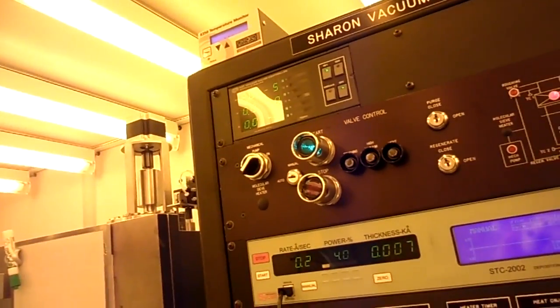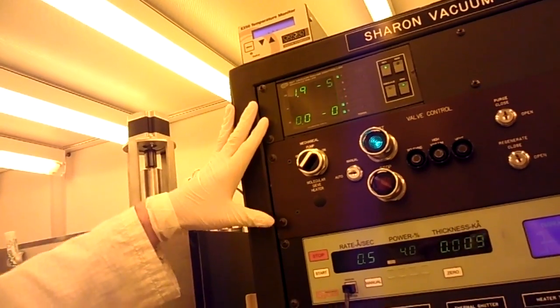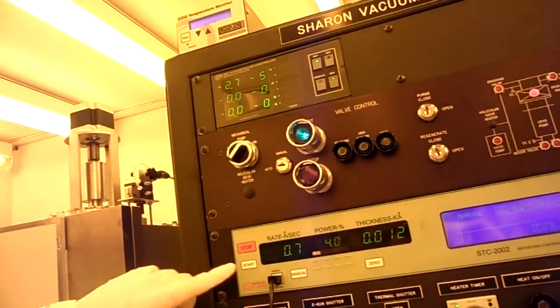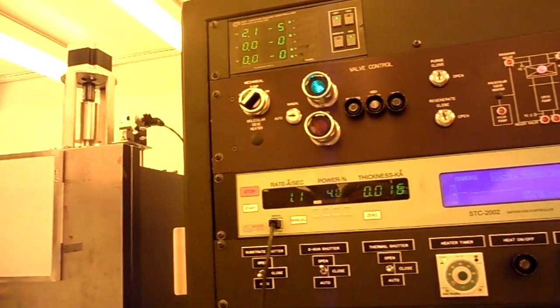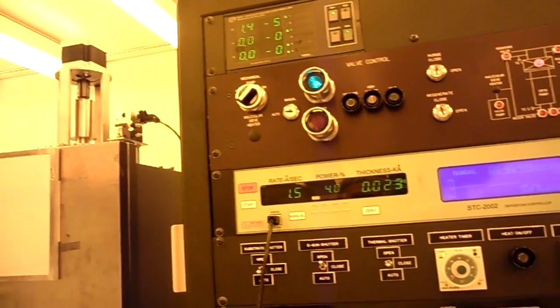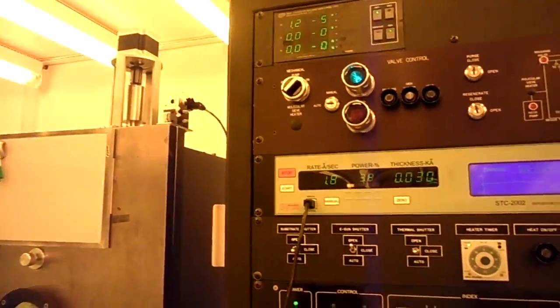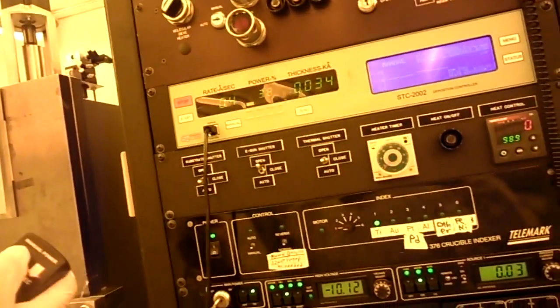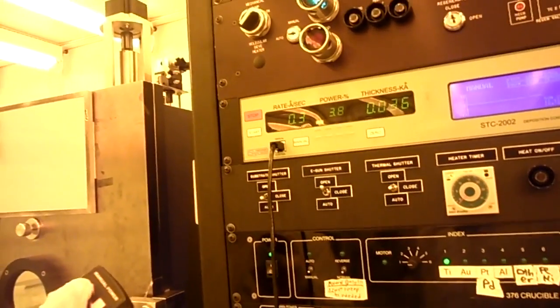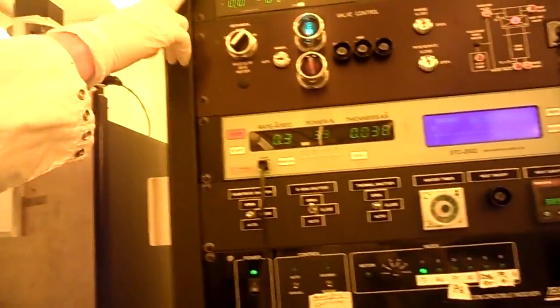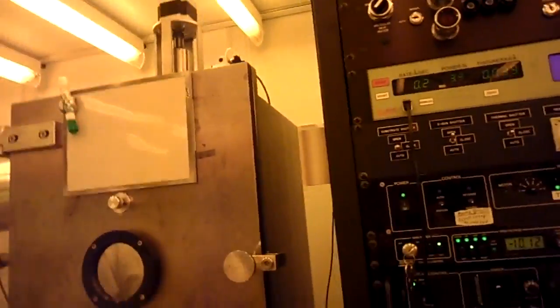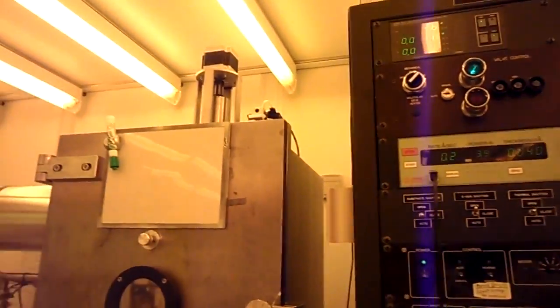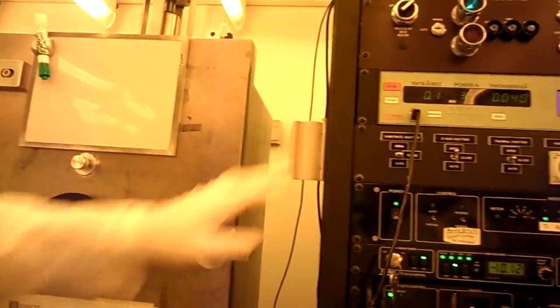And it's going to be higher than you normally want to see it because we didn't wait a long time. And you can see my rate has gotten really big now. Everything is melting. That's fast, right? One angstrom a second, two angstroms a second. That's about as fast as you want to go for a thick film on this machine. I mean, you can try to run it faster, but it's going to fluctuate a lot. And you can see it's exquisitely sensitive. I went down by 0.2% and my rate falls dramatically. So, when I was at four, it was way too fast. But you can see our pressure has gotten better again. And as I evaporate titanium, it will steadily get better and better. And we'll end up with a lower pressure than where we started. But that only works for titanium and maybe a couple of other materials. Now, sometimes you'll see the rate do this. And that's as things melt and move around and stuff, sometimes that happens.